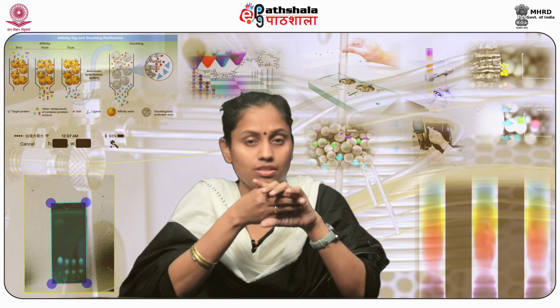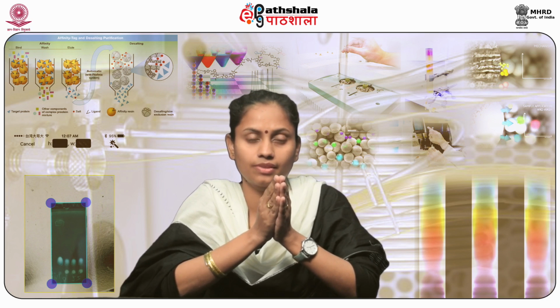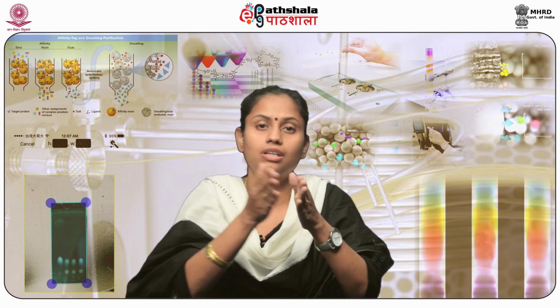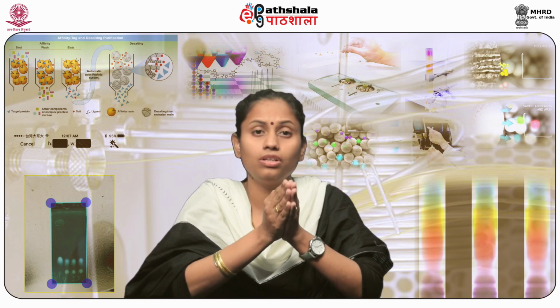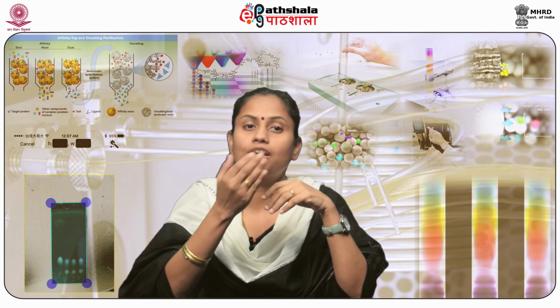Next, the mobile phases used in ion exchange chromatography are aqueous acid and base solutions. It can be an organic solvent, it can be a non-aqueous solution, or a combination of solvents. The separation of molecules from a mixture depends highly and strongly on the ionic potential, which is linked to the ionic charge, that is Z, and ionic radii, that is R. Molecules with high charge and small radius bind strongly to the matrix. Molecules with low charge and large radius exhibit weak electrostatic binding, hence they are eluted first.